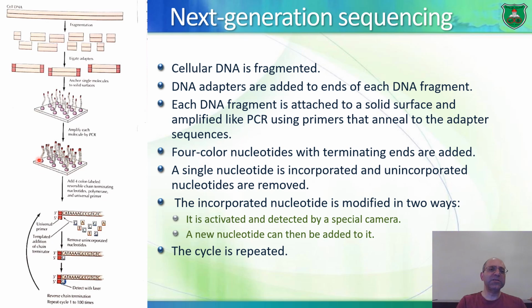Well, this platform right here can have billions of clusters, billions of DNA fragments attached to the solid platform. Well, how can we sequence all of these billion fragments at the same time? Well, that's technology. You have a camera that records what each one of these clusters does, what each color is given by each one of these clusters.